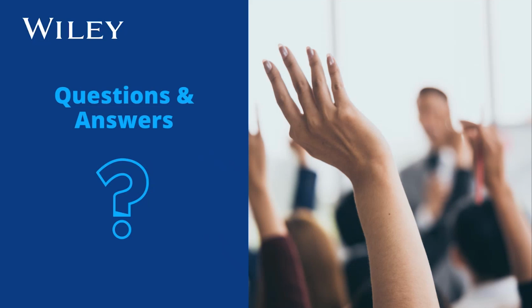How about this? Can one perform an MS search with additional criteria such as properties? Yes. For example, that's what we covered in one of the answers. You have an MS spectrum and you have other properties such as TIC values. You could define both of them. The relationship of these two different criteria is AND. So the logic is AND if you narrow down your search result. Thank you.